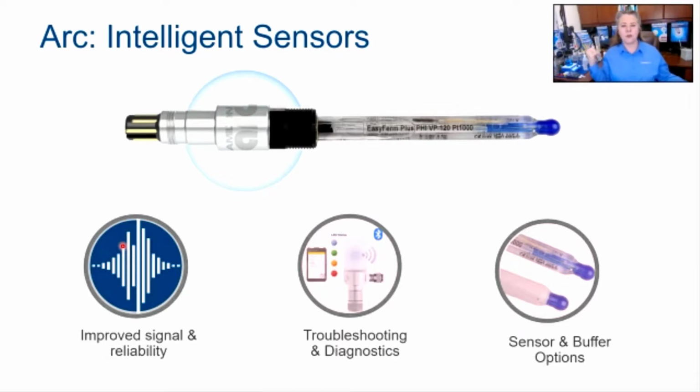If an oven turns on nearby with an analog signal and there's a line current voltage that causes a 60 hertz current surge, you can actually see that sometimes in analog probes, which can lead to incorrect byproduct or automation or feedback loops. So having a digital signal that's not impacted by any of those is incredibly useful.